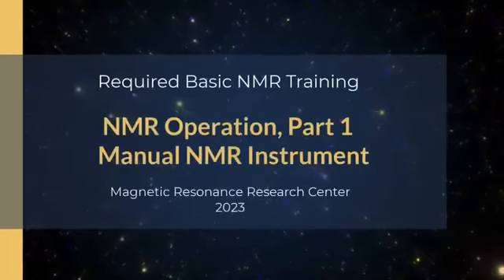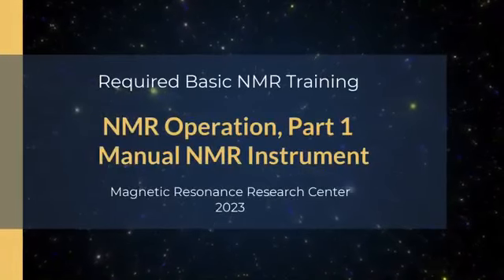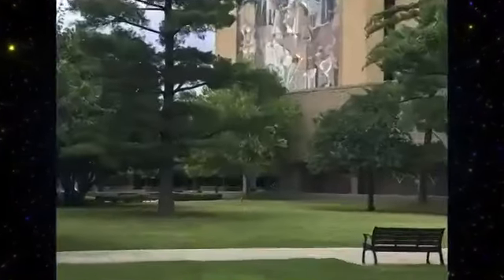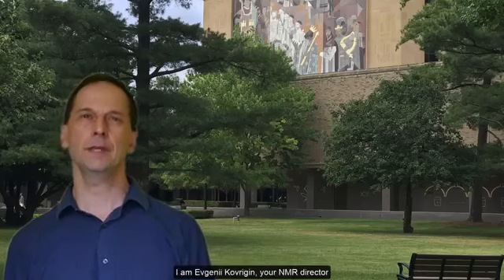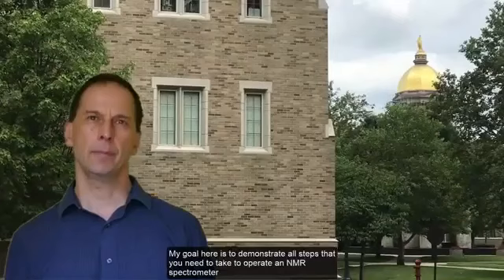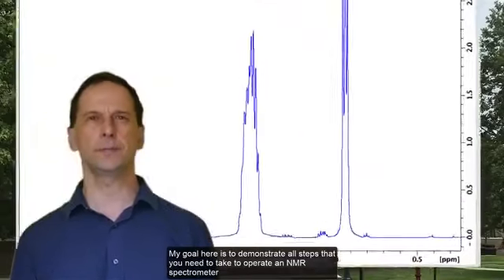Chapter 1, Introduction to Nuclear Magnetic Resonance, NMR, Spectroscopy. Chapter Objective: to establish the fundamental physical principles that underpin all NMR experiments, providing the necessary theoretical background for understanding practical operation of the AV3 spectrometer.